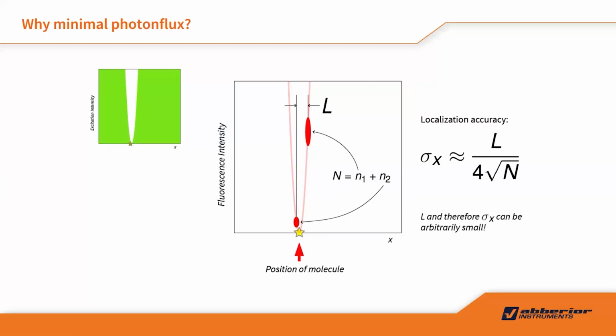How to reduce the error? I explained already in the STED. You just increase the laser power, right? Instead, you increase the STED laser power. And in MINFLUX, you increase the excitation donut laser power. The error is getting smaller and smaller. That's why we do the iteration. With one large error, then we move to a small error, even further smaller, and then the accuracy is improved and improved to the maximum of that system. It's always around 1 to 2 nanometer if you prepare a sample very nicely.